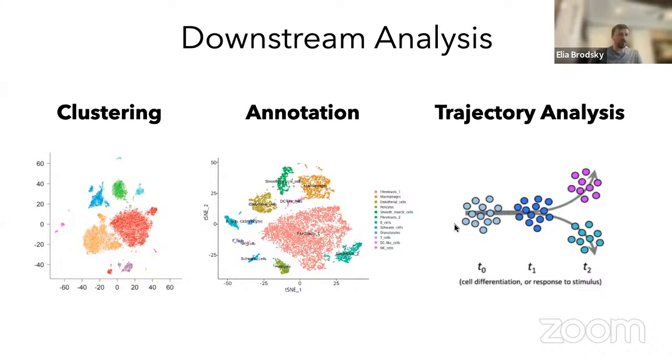And the final kind of analysis that you can perform in some cases is to try to determine exactly where in a trajectory of development a particular cell group is now in my sample, right? So why is this an important thing, and why do we not do this in bulk RNA-seq? Cells are not static. Cells are dynamic.